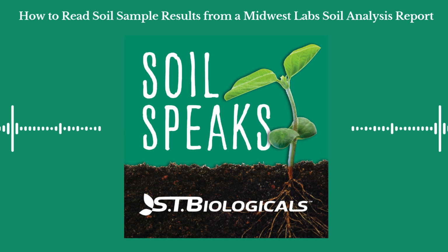Reading soil analysis can be overwhelming. If you've been reading them for a long time, you look for specific patterns, but you may be missing some key indicators simply because you've never thought they were important. Soil is complex. Everything is related and impacts all other aspects of soil.